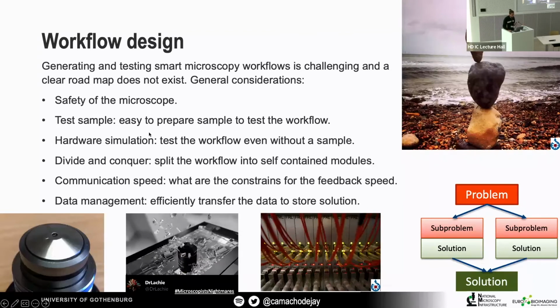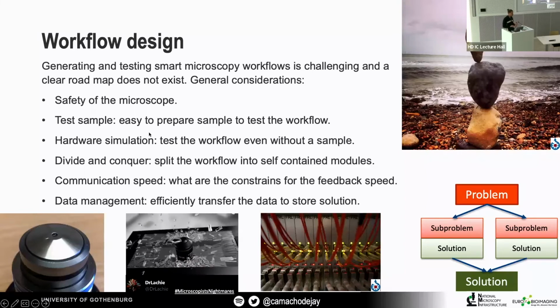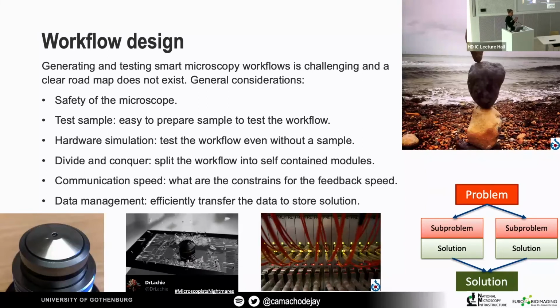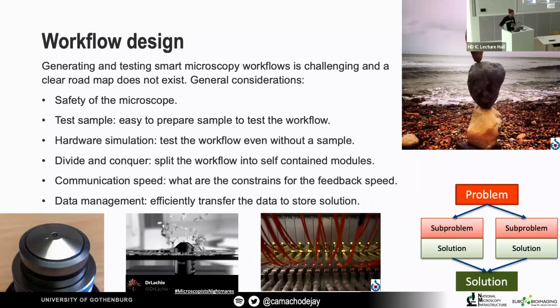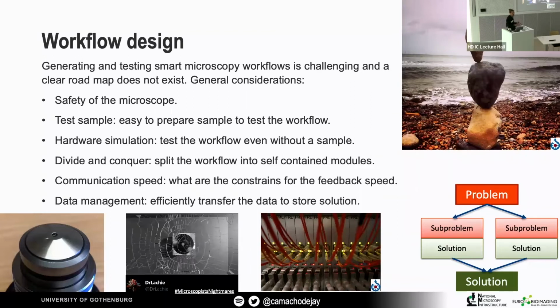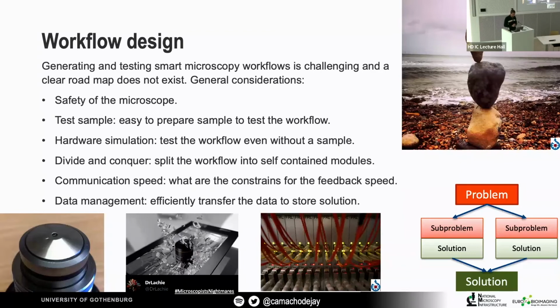Consideration number two, which is very important, is to have test samples that are easy to prepare for the workflow, right? Unfortunately, a lot of the real biology that we want to study involves samples that might take weeks to prepare, right? That are extremely expensive for the user to do. We don't want to test our protocols on that. So we have to find strategies for, okay, what is the simplest, most basic test sample that I can use to make sure that the workflow is working.